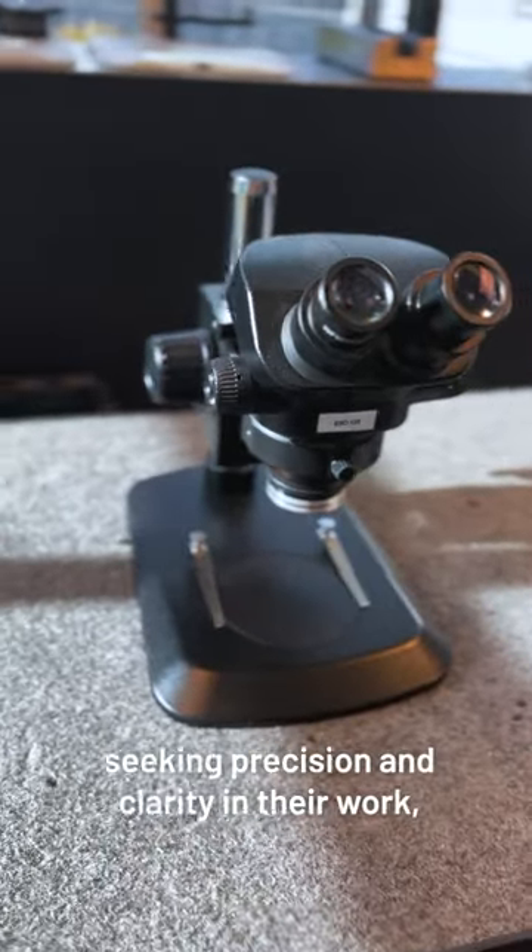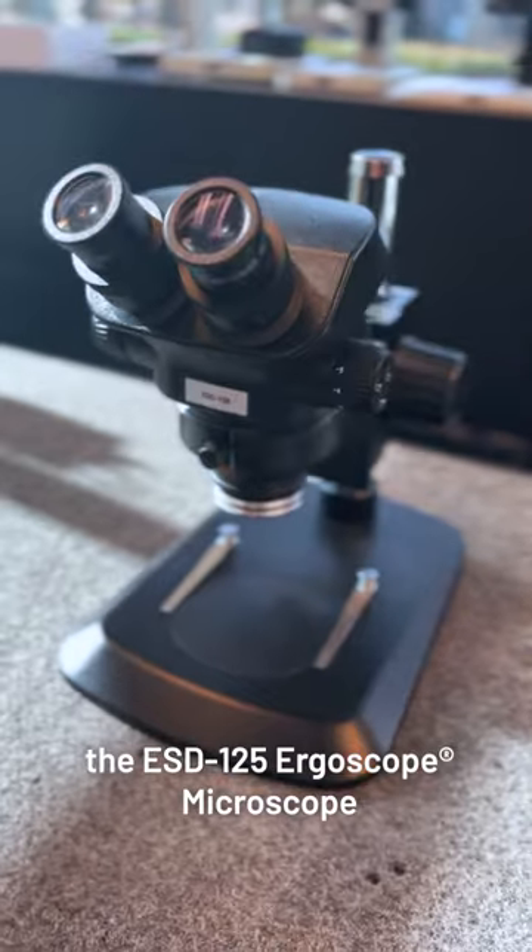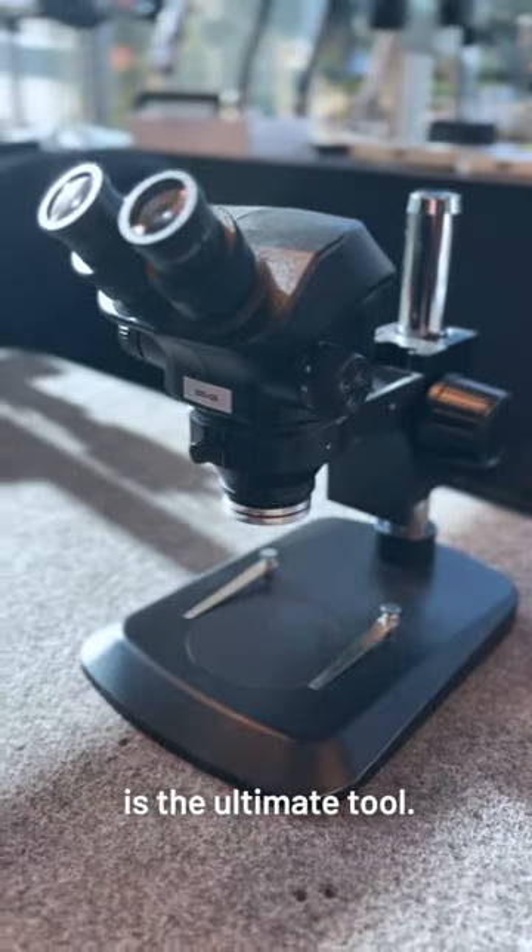For quality control professionals seeking precision and clarity in their work, the ESD125 ErgoScope Microscope is the ultimate tool.